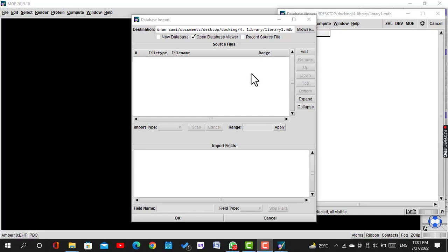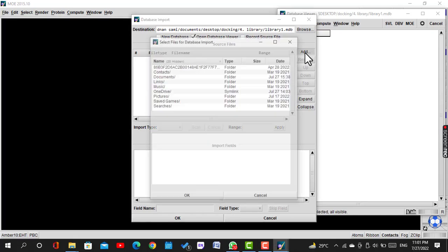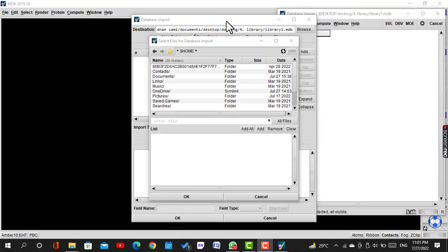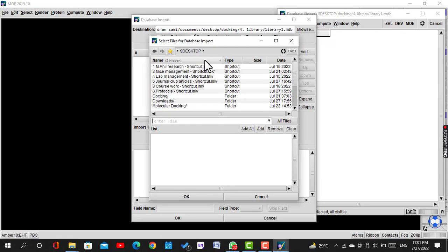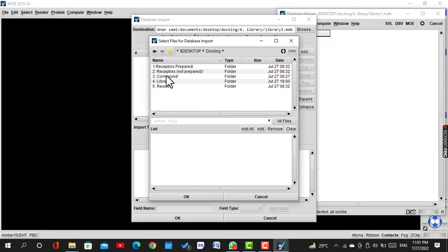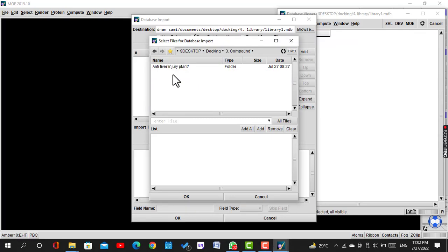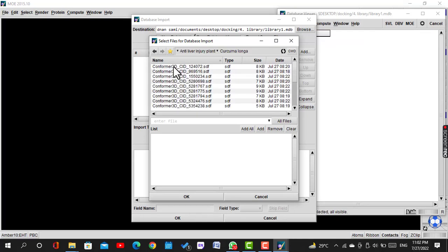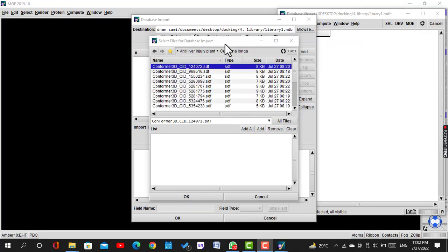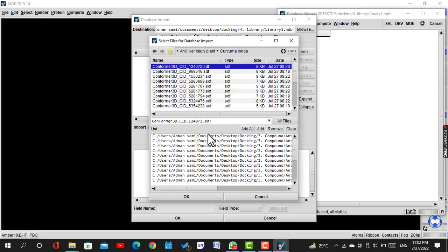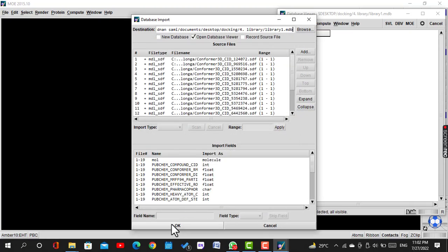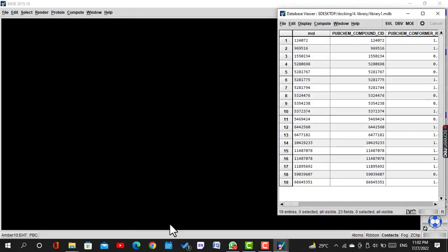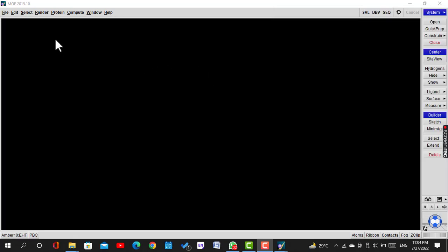A new window will be opened. Click Add, and then search and open the folder containing 3D structures of ligands. Click on Add All, then OK. Now this library is ready for docking.